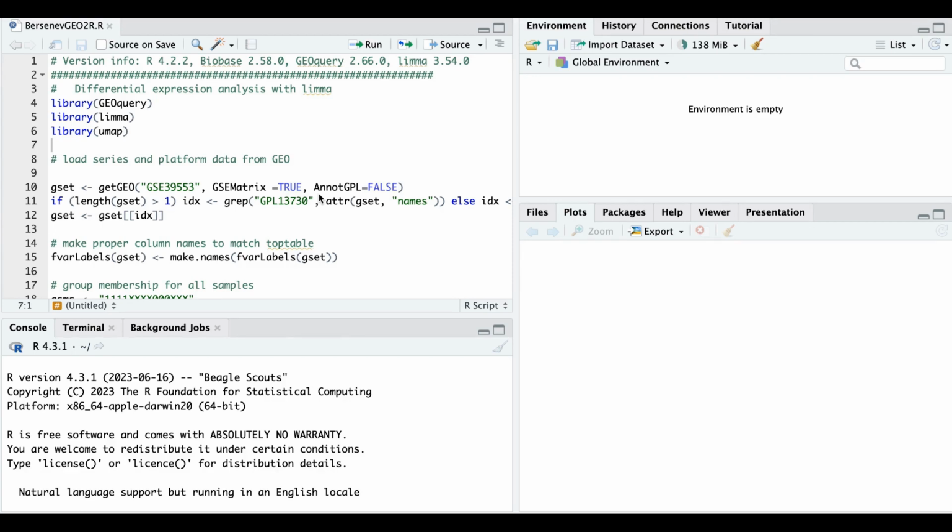However, when you select only one data set out of many, of course you can apply some particular simplifications and modifications specific for this particular data set. It begins as usual. It's always nice to give comments about where it's from and what it is.